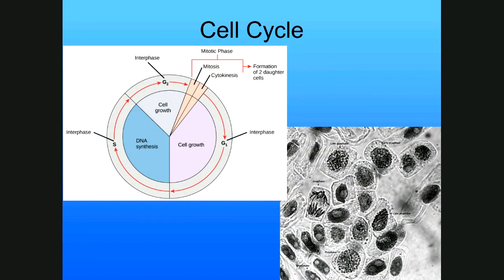And so the first thing you want to do is, on page 2 of your handout, you're going to have a root tip, and we're going to ask you to identify some of the things you see there. And Larry's got different pictures. So here you'll see pictures in your handout that show you pictures of anaphase and prophase. And so what Larry wants you to do is to then identify. So there's your anaphase, there's your prophase.